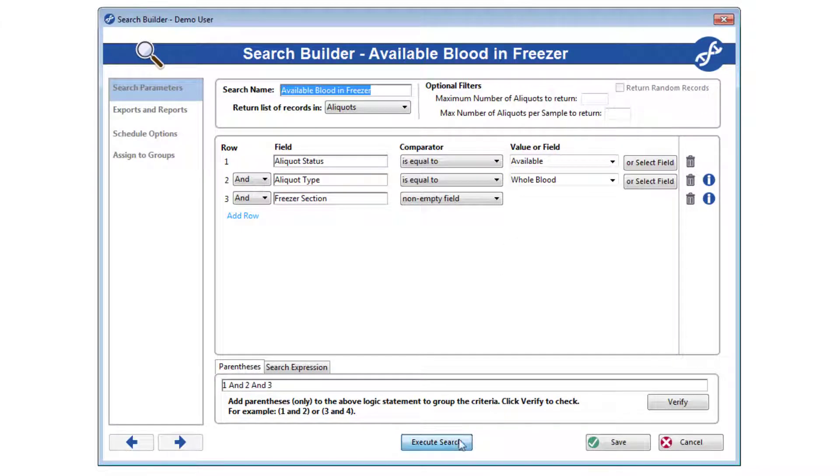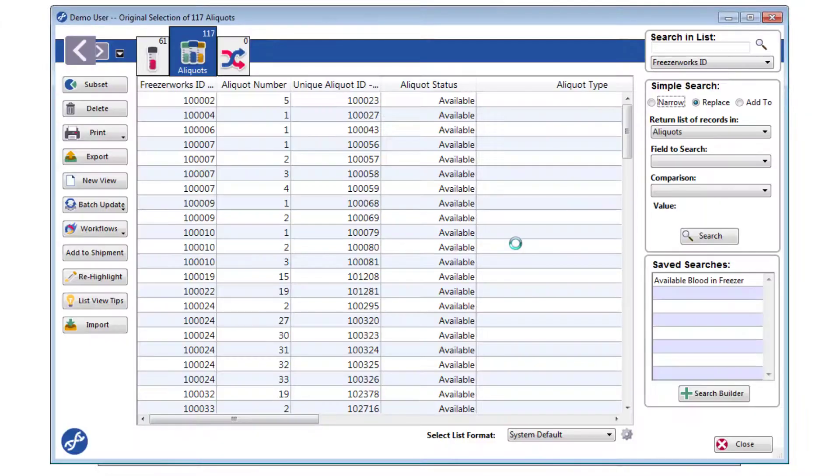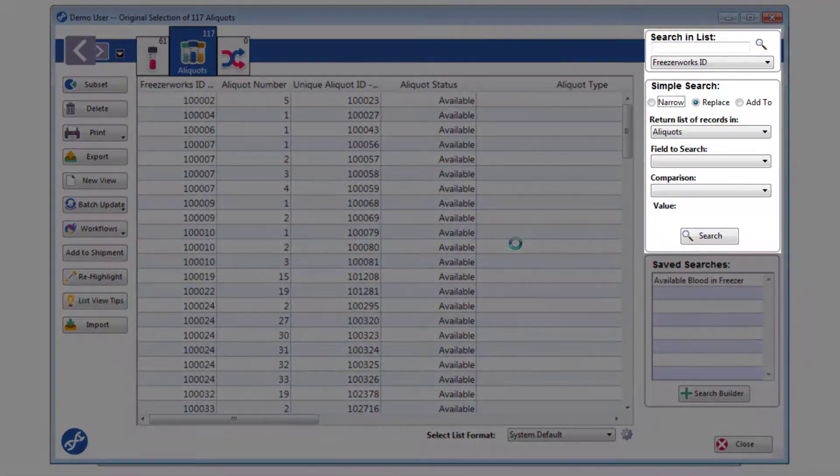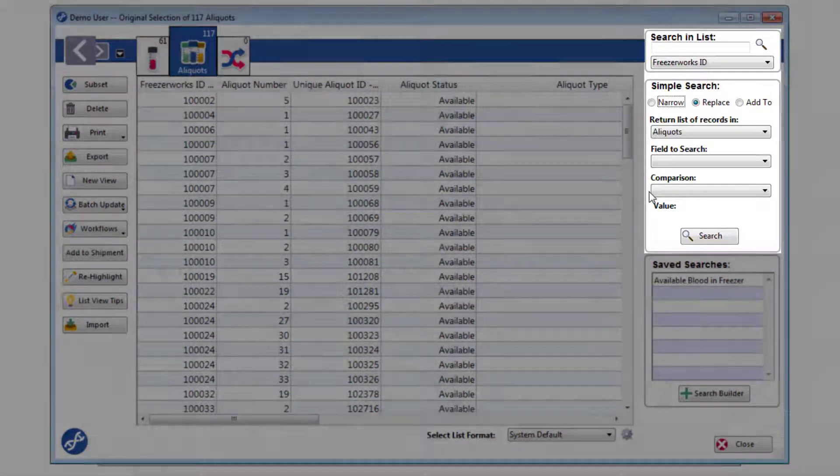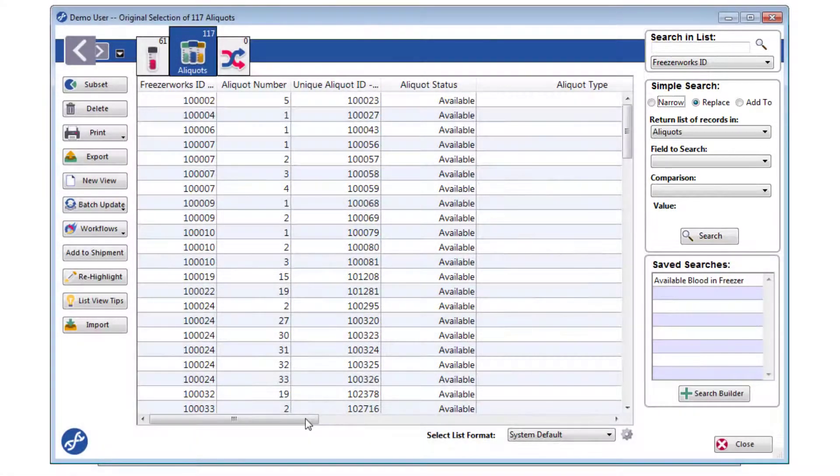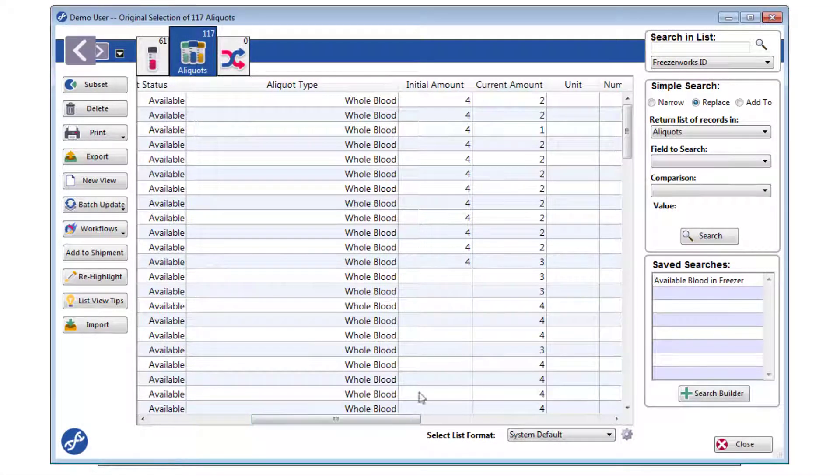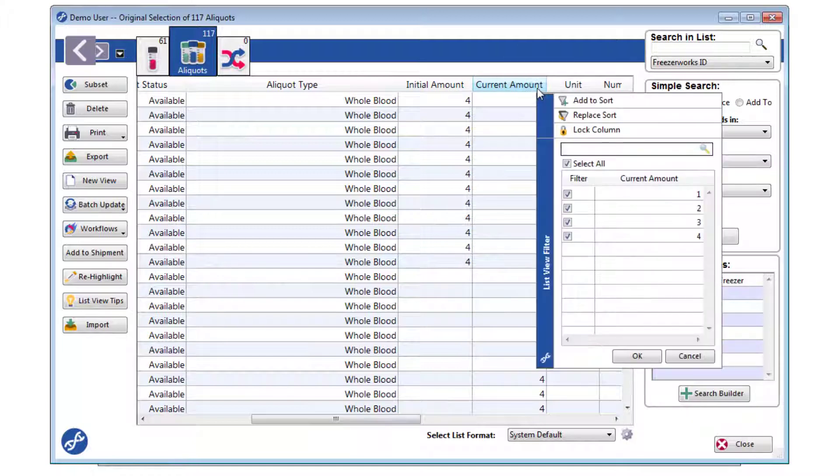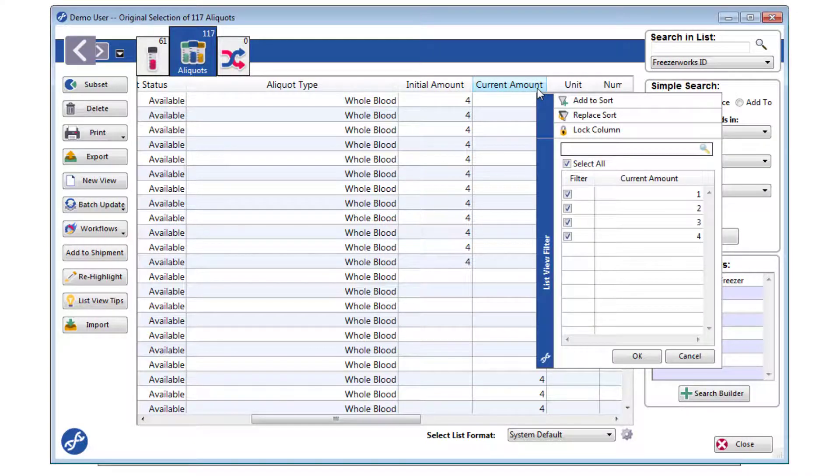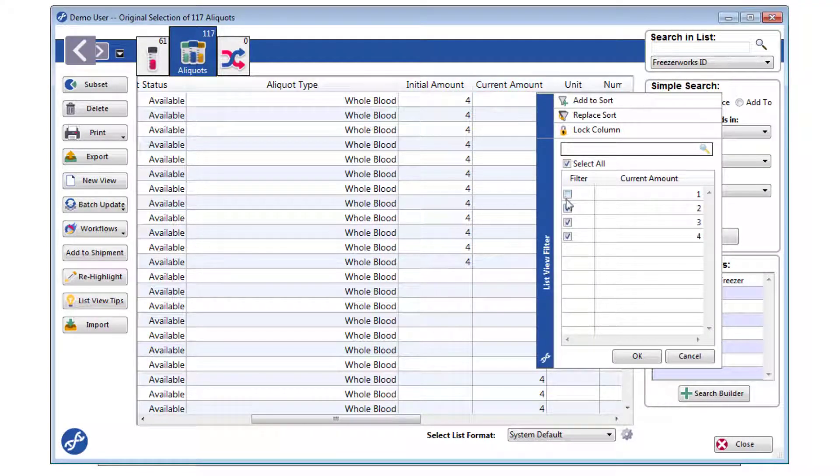Then you can further filter your results by using the search options on the right-hand side of the list view, or by right-clicking column headers. Doing this opens the filter tool, where you can check off undesired values, such as aliquots with a low current amount.